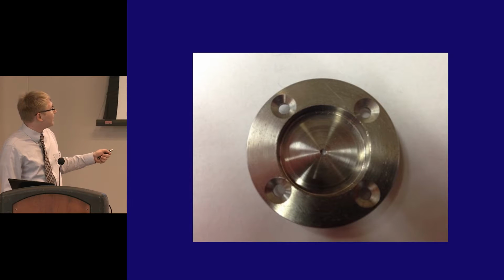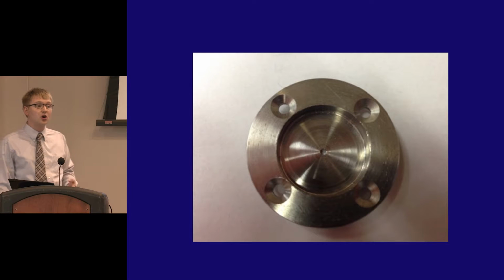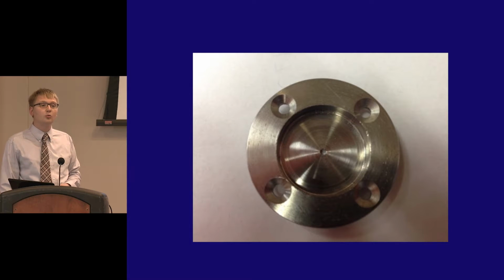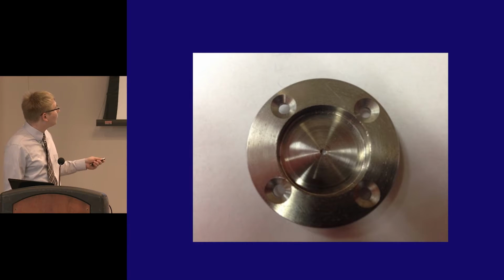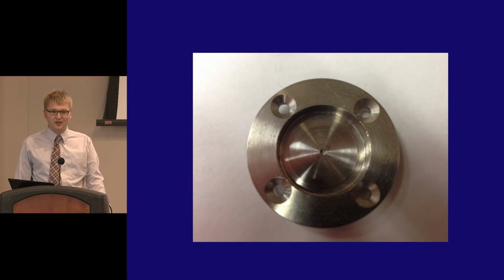All the ions must pass through this small hole in the middle. They're focused by the ion guide to permit almost all of them to pass. However, the hole will only permit a small amount of ambient gas to pass as well. Once we pass through about 4 of these, we'll go all the way from room pressure to 1/billionth of 1 atmosphere.